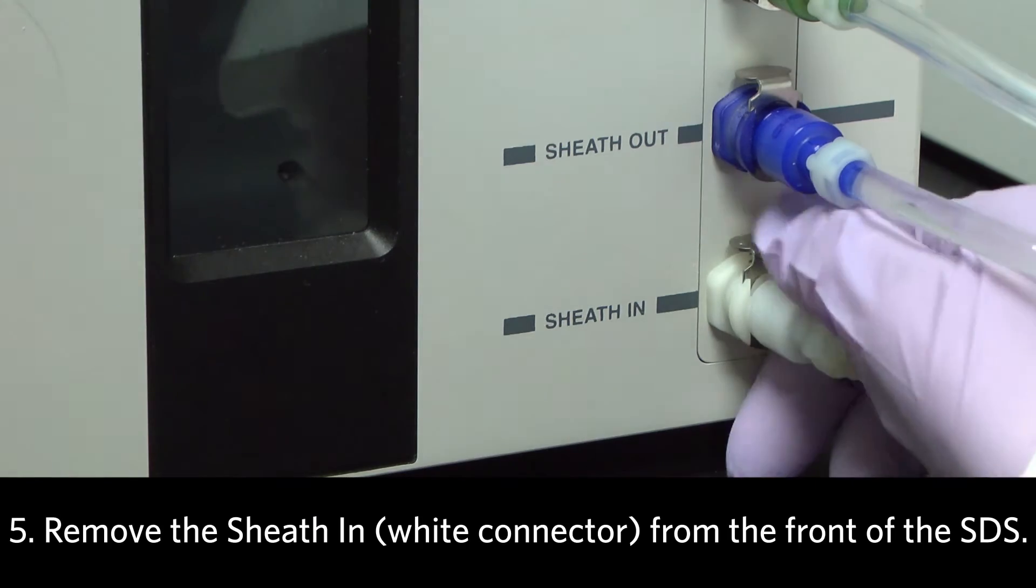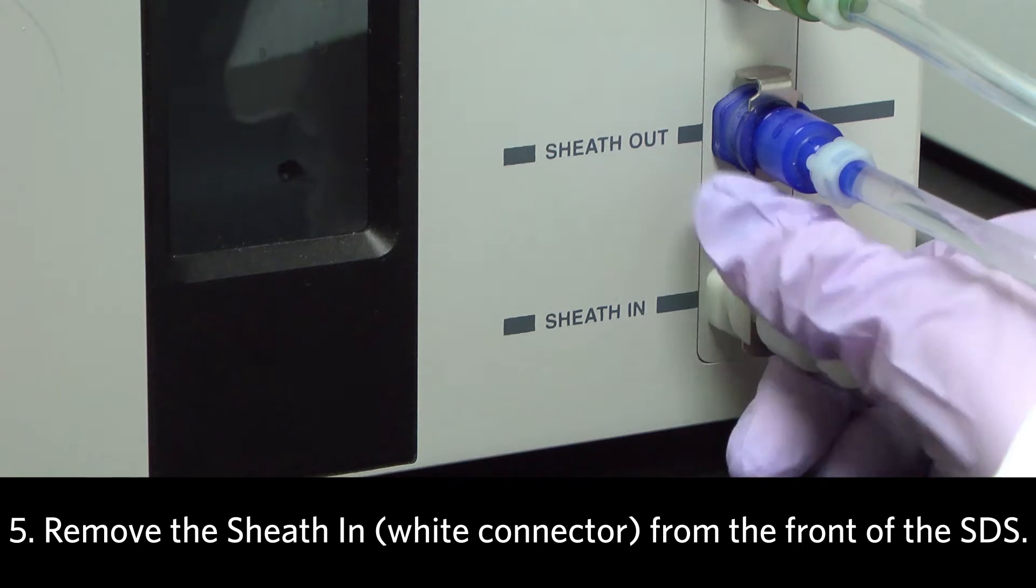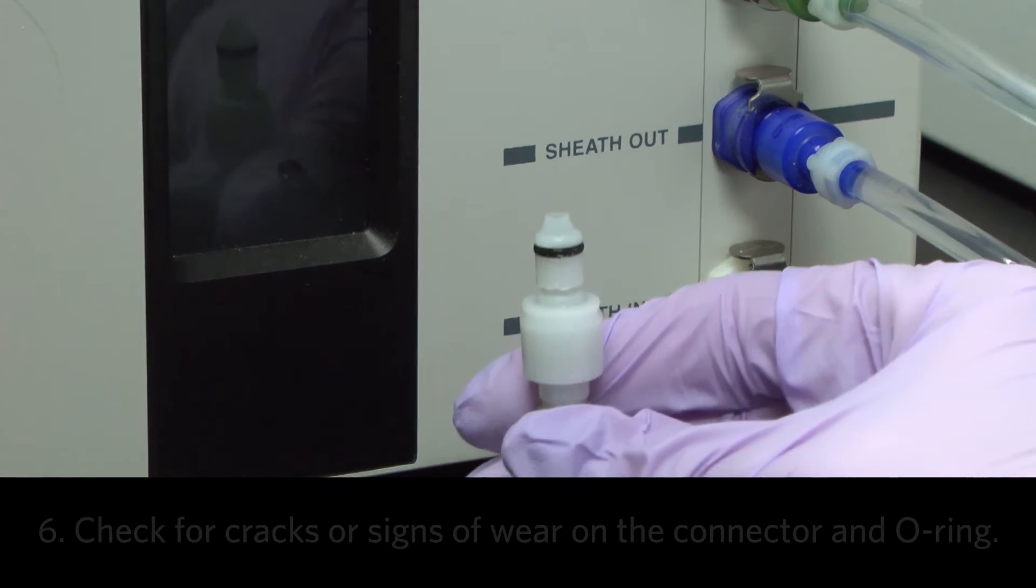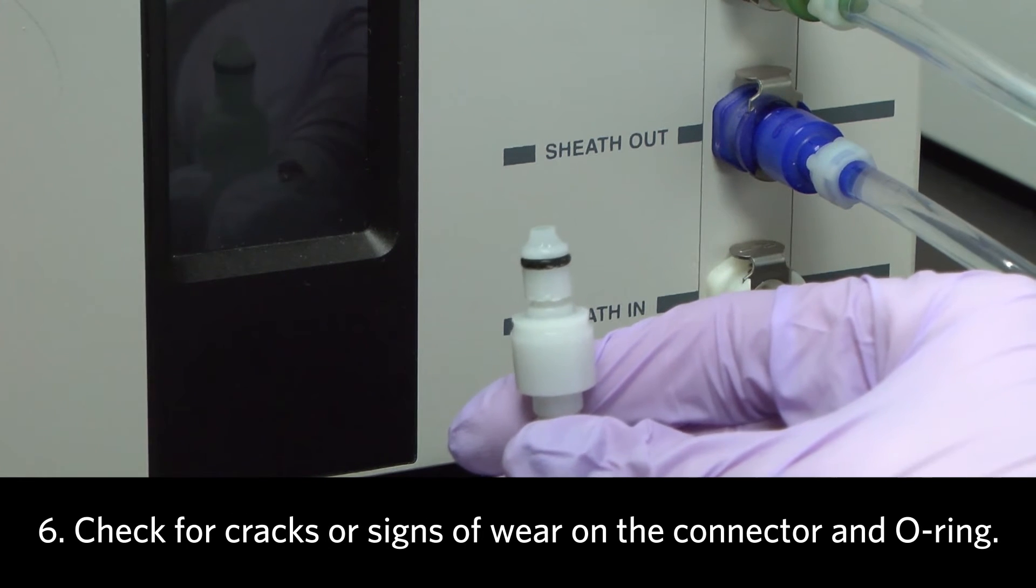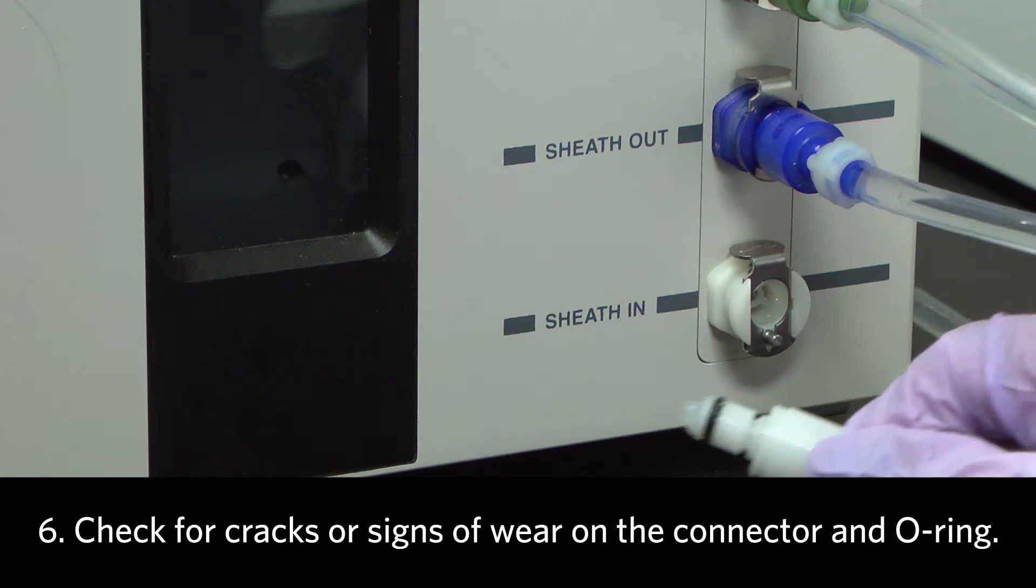Remove the sheath-in white connector tubing from the front of the SDS. Check for cracks or signs of wear on the connector and O-ring.